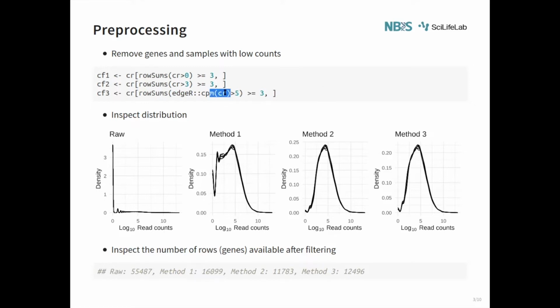And if you read through the documentation from, for example, DESeq2 or one of these vignettes, this is the sort of approach that they use because it's a bit less subjective. But this 5 depends on your data set. Usually 1 works, but you plot out your counts and see how they look, and then you can decide if you want to adjust that a bit.